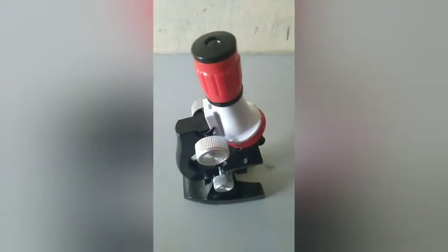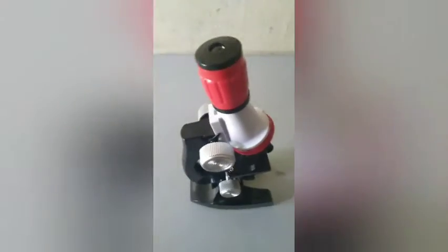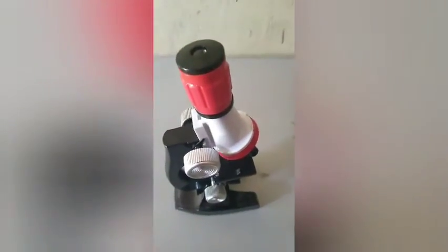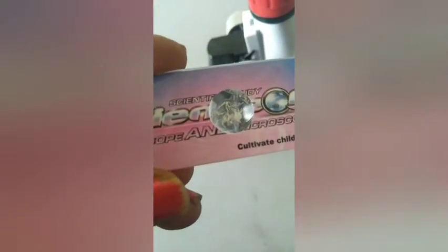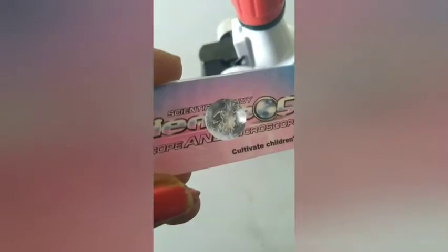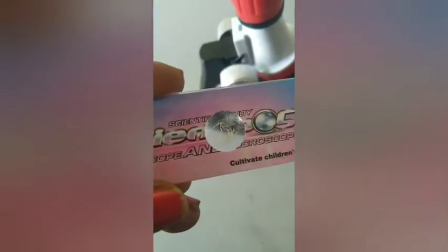Now let's check what we are able to see in this microscope. They have given one pre-prepared slide. We can now see what we can see using that. This is the pre-prepared slide — there is some particle inside. I don't know what it is, but something is there. They have not mentioned what it is.